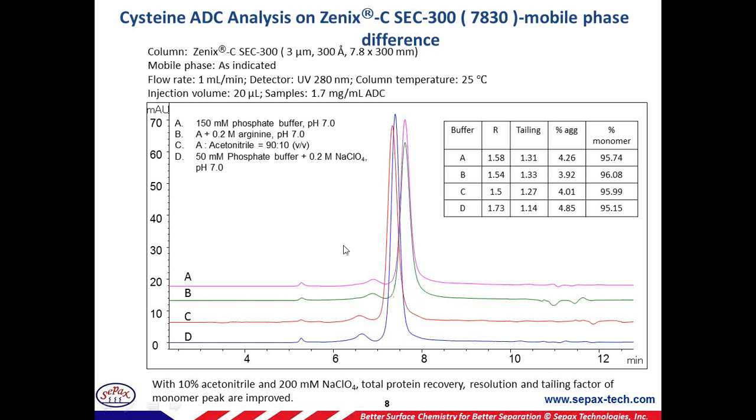We are able to get an intact mass for Herceptin. It's about 148 kD. Then for the lysine conjugates, we're able to see up to 5 drug conjugates. For the Herceptin cysteine, here, as I labeled, there are a few combinations of subunits.